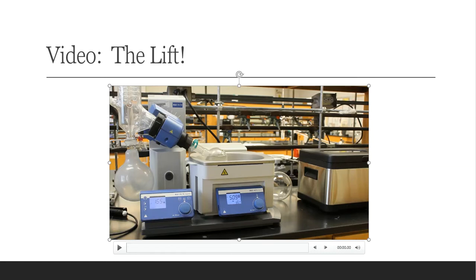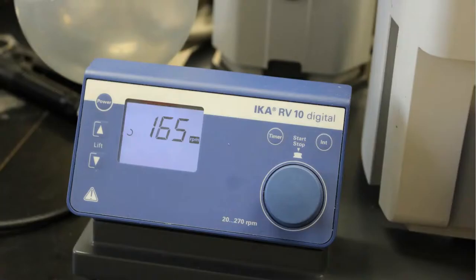But at the same time, I also want you to look at the company that makes this rotovap. It's one of the major companies out there on the market, and this company is called IKA. I-K-A. IKA is here in Wilmington. If you are familiar with the Laney High School area, you're going to see IKA located at that location. So that is a hub for them. They do a little bit of their own testing there. They have a couple of different types of job responsibilities and job roles that people are hired on to do at IKA. But this is a scientific instrumentation company, and it's here in Wilmington at your disposal, at your convenience, and maybe even a possible employer for you, depending on what route you want to go in.